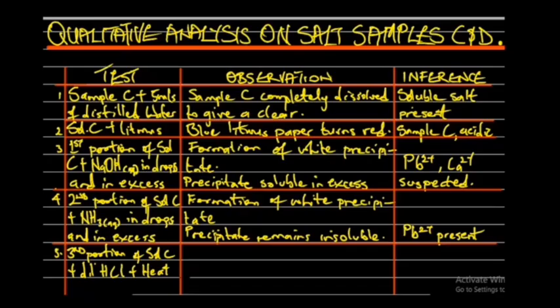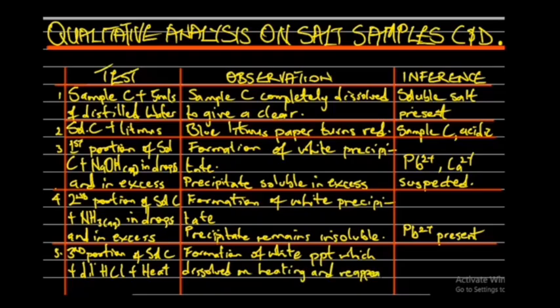We discovered the formation of a white precipitate, which dissolved on heating and reappeared on cooling.